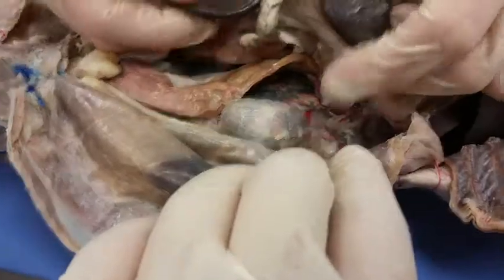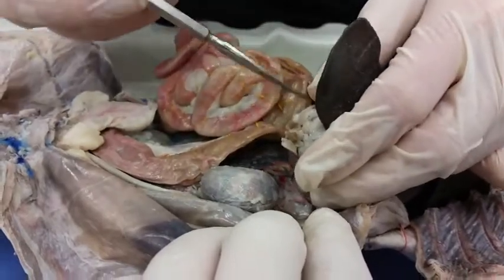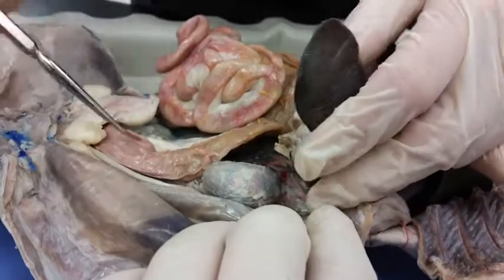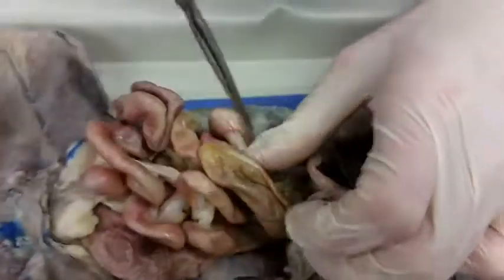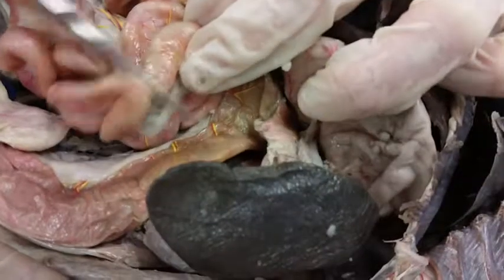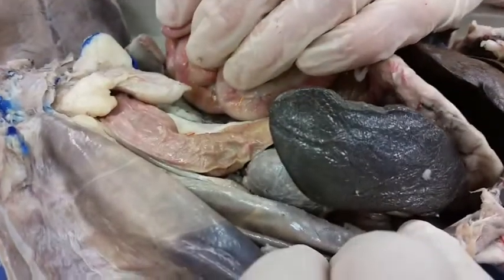As you can see there, this little baby is the spleen, which is right next to the descending or large colon, descending colon, and then the ascending colon is back over in here. So it goes ascending, where it comes from small intestine, ascends, and then descends towards the rectum, which will be obviously down here.